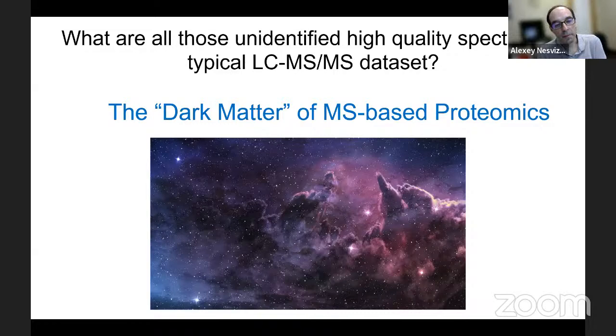Thinking that there would be spectra corresponding to post-translationally modified peptides, or peptides harboring a mutation, or maybe novel peptides. And of course, a lot of spectra were also chemical artifacts. And it's really now 20 years later. We have all this suite of tools, but in fact, it's because we really wanted to go deeper in the data and identify all these peptides.